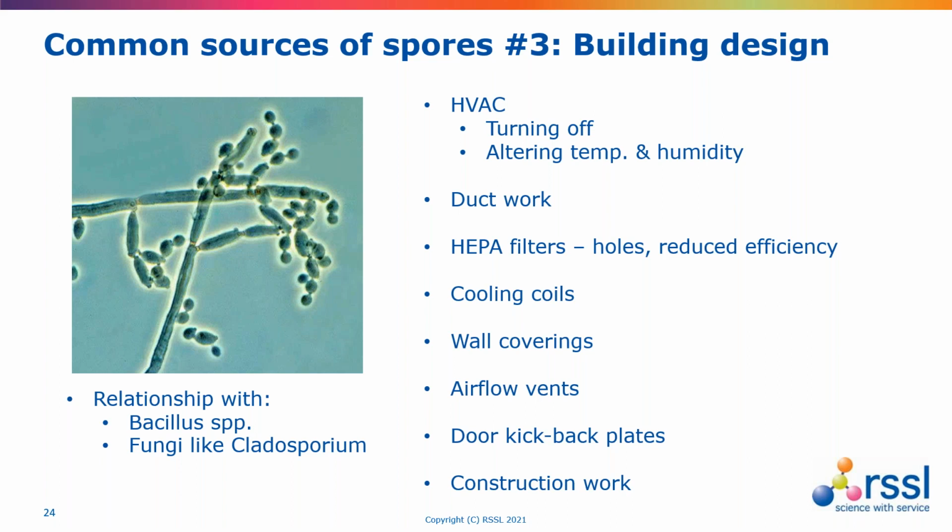There are other areas where spores can arise, or particular risk factors. As a general rule, if HEPA filters or air handling systems ever have to be turned off, which might happen for maintenance purposes, then the potential risk of spores being introduced remains much higher. That's normally followed by some form of sporicide or disinfection. And obviously, never turn HEPA filters or HVAC systems off.